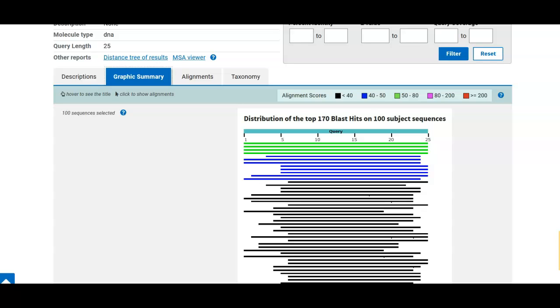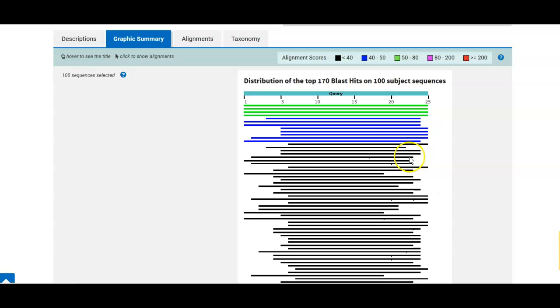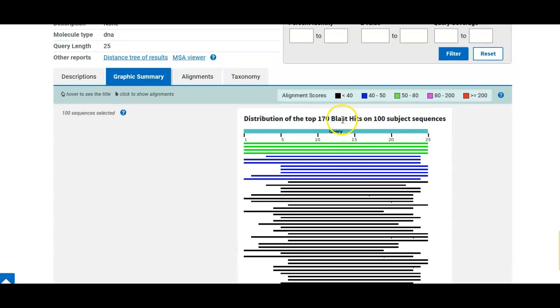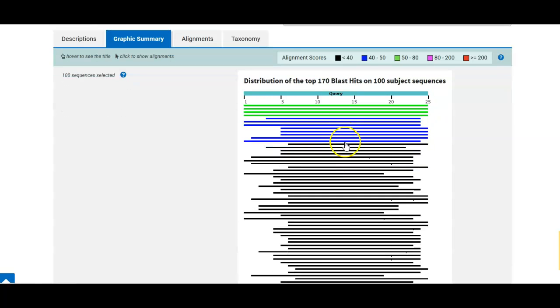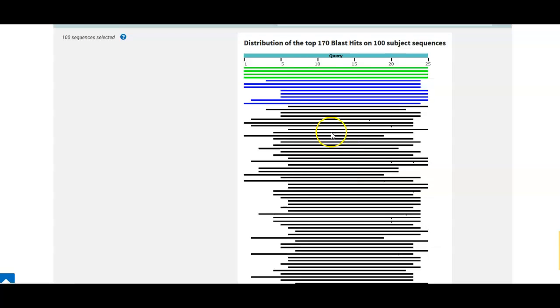And so we can see here which ones these are and how these first four do represent the 100% alignment. And then I like this also because it shows where these things have a query covered. They're not all covered. And therefore, if the alignment scores are lower, that's where your graphical information is. So it's a really nice graphical way to see, if you were to line all these up, how do they look and where are some of them truncated? For example, this one right here is missing the 5' end of this residue sequence.